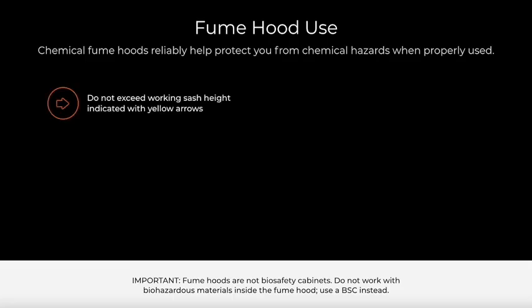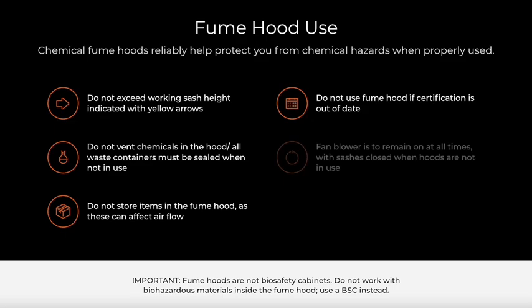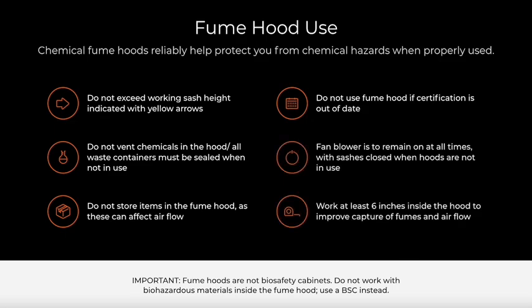Fume hoods are a crucial safety feature in any laboratory where chemicals are used. They help protect individuals from chemical hazards by creating a barrier between the user and the chemicals. However, for the fume hood to be effective, it must be used properly. Here are a few important guidelines for using a fume hood. Do not exceed the working sash height indicated by the yellow arrows. This can affect the hood's ability to capture fumes and protect you from chemical hazards.